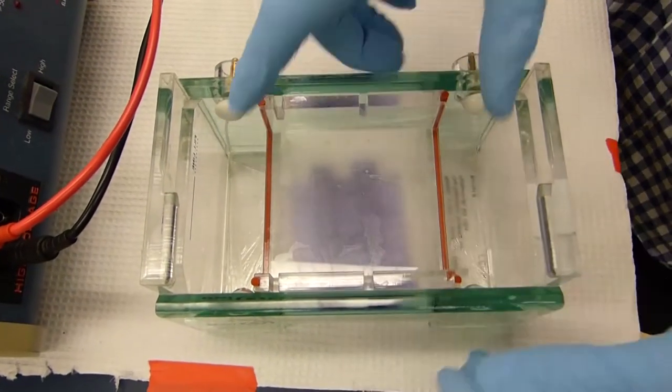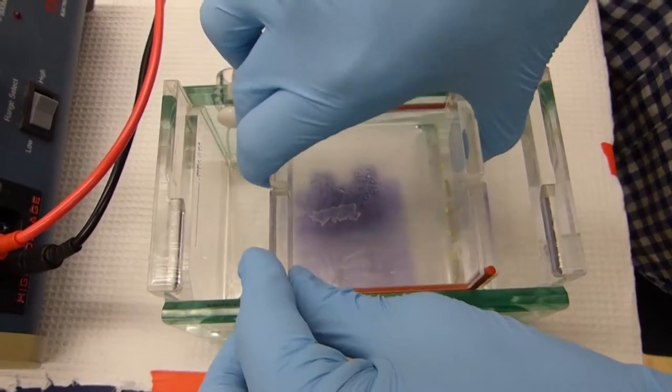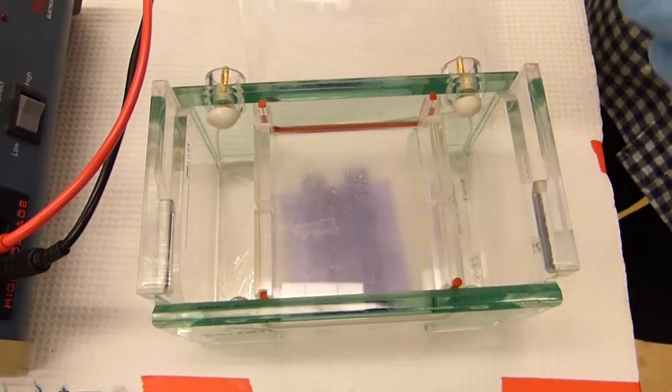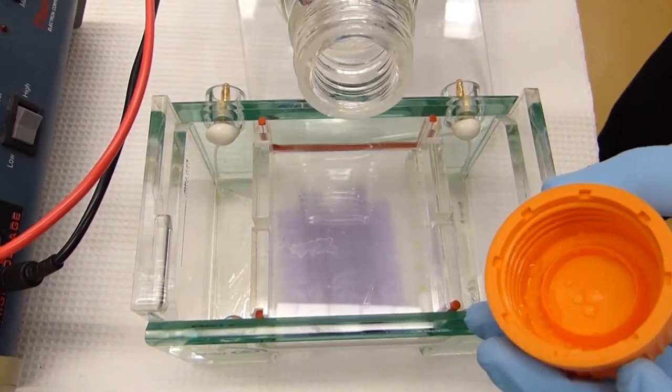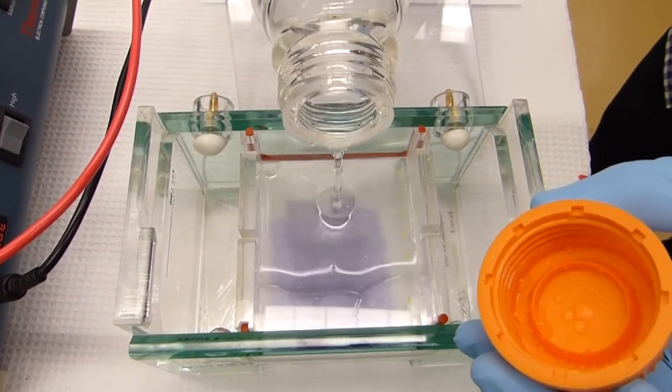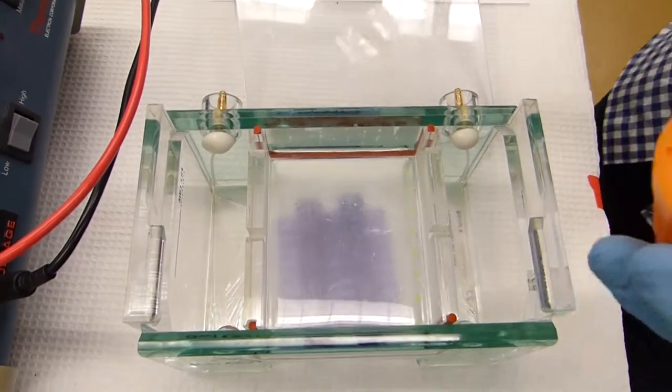To make the gel, I'm pouring molten agarose into the gel cassette. The solution is 1% agarose made with TAE buffer and contains ethidium bromide so we can later visualize the DNA. One gel requires about 50 milliliters of solution and after pouring we let the gel solidify.